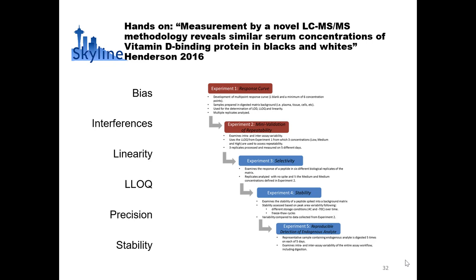I would encourage you to not spend all of your time in this hands-on section doing just one of the data sets, but try to look at the different data sets. They are kind of set up the same way, but the data is very different because it was different experiments. I don't know if I have Skyline on this computer, but if I do, I will try to open it up and show you some of the tricks that I like to use.